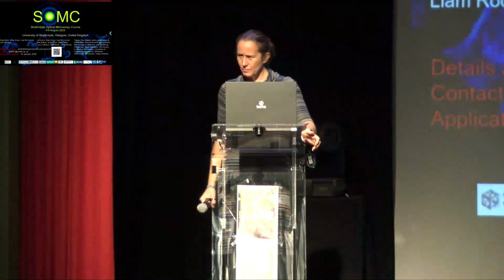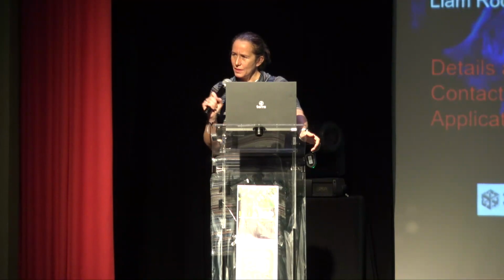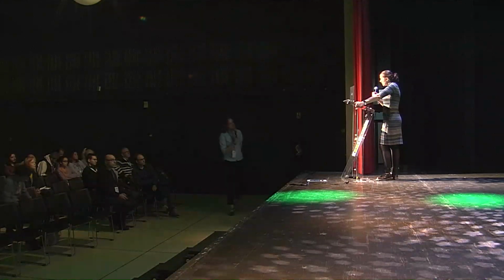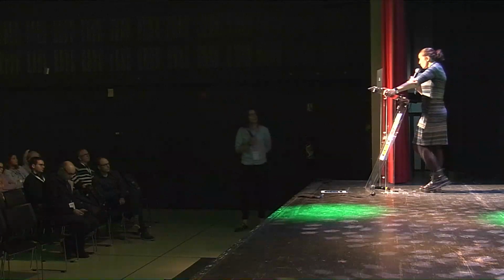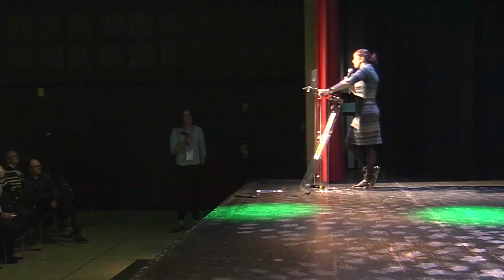Can you tell us more about the processing that you use for the 3D printing optics that you showed in the end, at the very last slide? Like what kind of processing? Is it chemical? Is it mechanical? Is it both? So this is resin printing. We've tried with extrusion, but it doesn't work so well because you get the scattering of light.